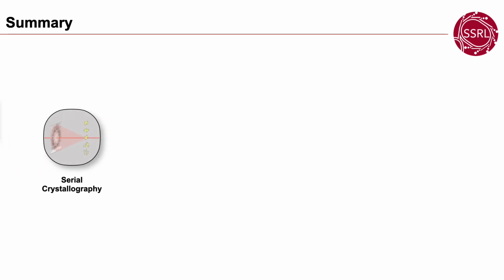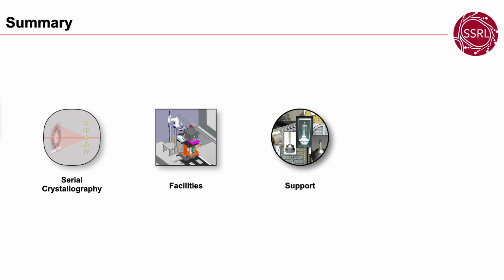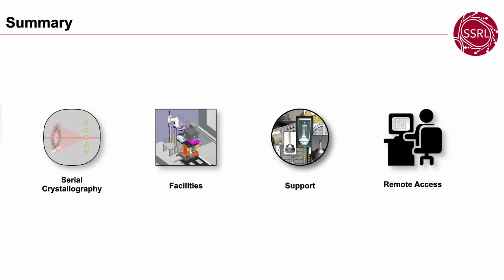Despite being a relatively novel technique, serial crystallography is now very well established not only at LCLS, that was built for the purpose, but also at SSRL beamlines. We have matching instruments between both LCLS and SSRL facilities and support for a variety of sample delivery devices, especially fixed target devices. And we offer remote access for most, if not all, of these experiments.